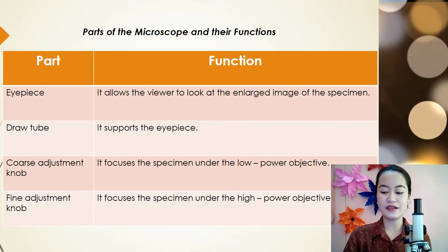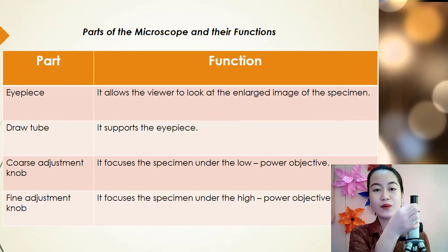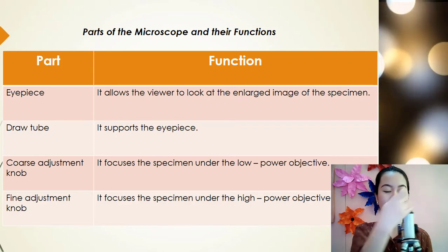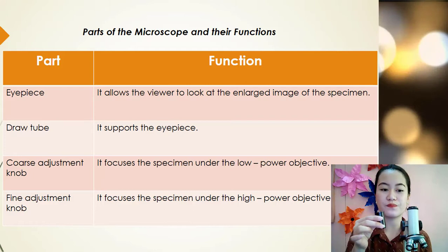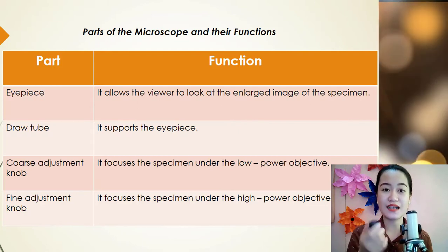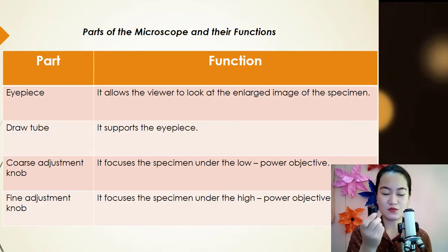Next, we have here the draw tube. So, what is the draw tube, class? Okay, so this is the draw tube. What is the function of draw tube? It supports the eyepiece. So, without draw tube, hindi niya masusuportahan si eyepiece. So, this is the draw tube.